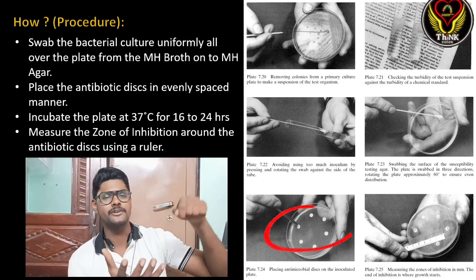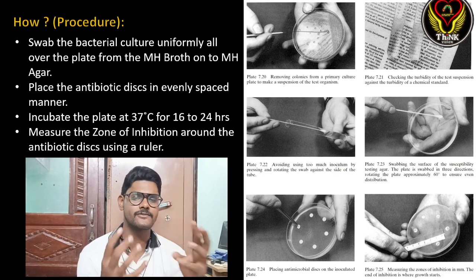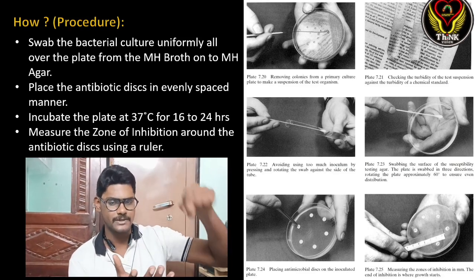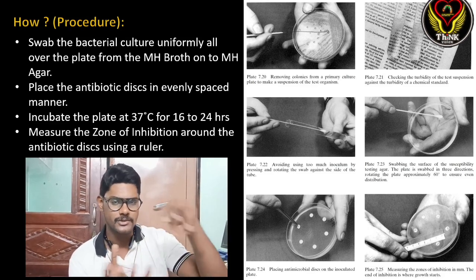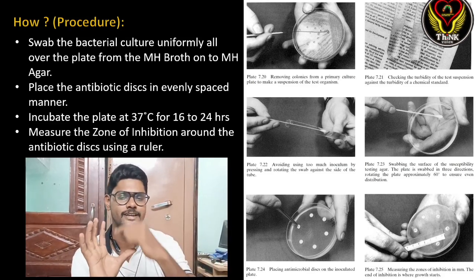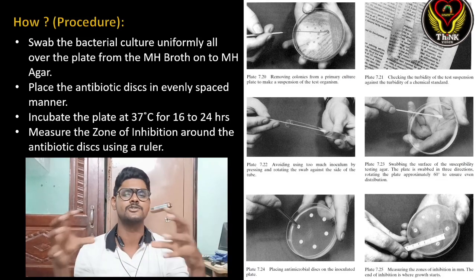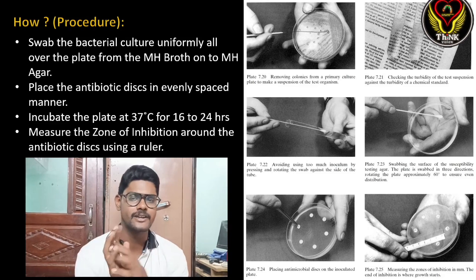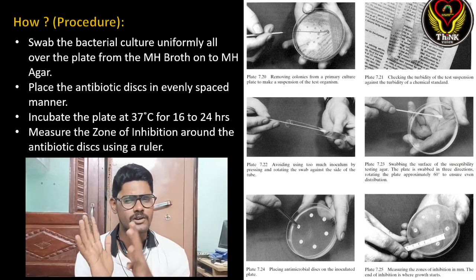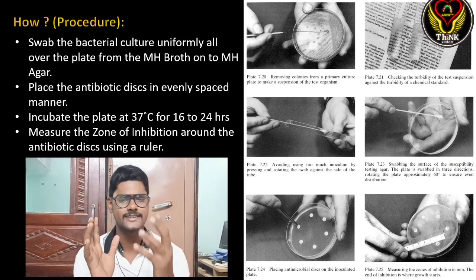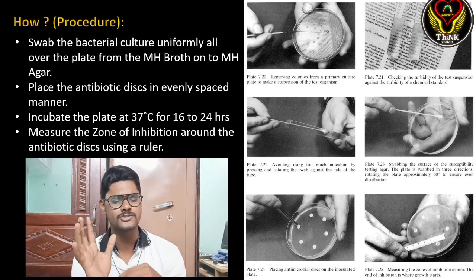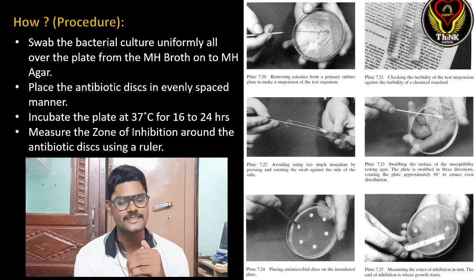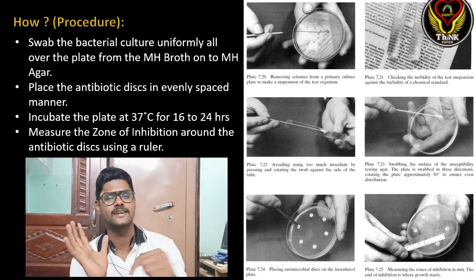The next step is to place the antibiotic discs in an evenly spaced manner. If you are testing three or four different antibiotics, choose the corresponding discs and space them evenly — they should not be crowded, otherwise the zones will mix and you can't read the results properly. At most you can keep around four to five antibiotic discs in the agar plate.